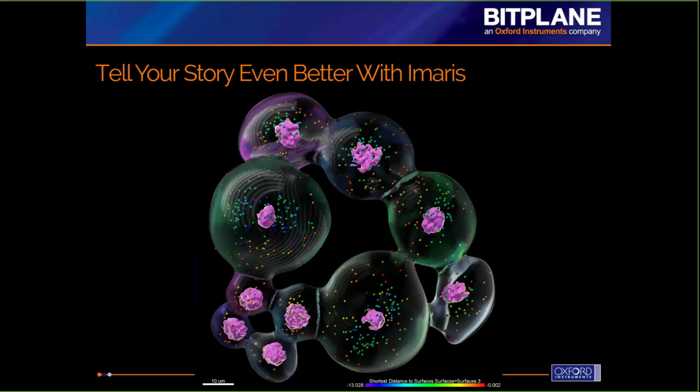And we really like this rendering because it is so transparent that you're easily able to understand what's inside of your object, in this case cells, and to see the nuclei inside of it, as well as the puncta that have been identified. And so again, here, what we're seeing is the distance of these puncta from the edge of the cells.